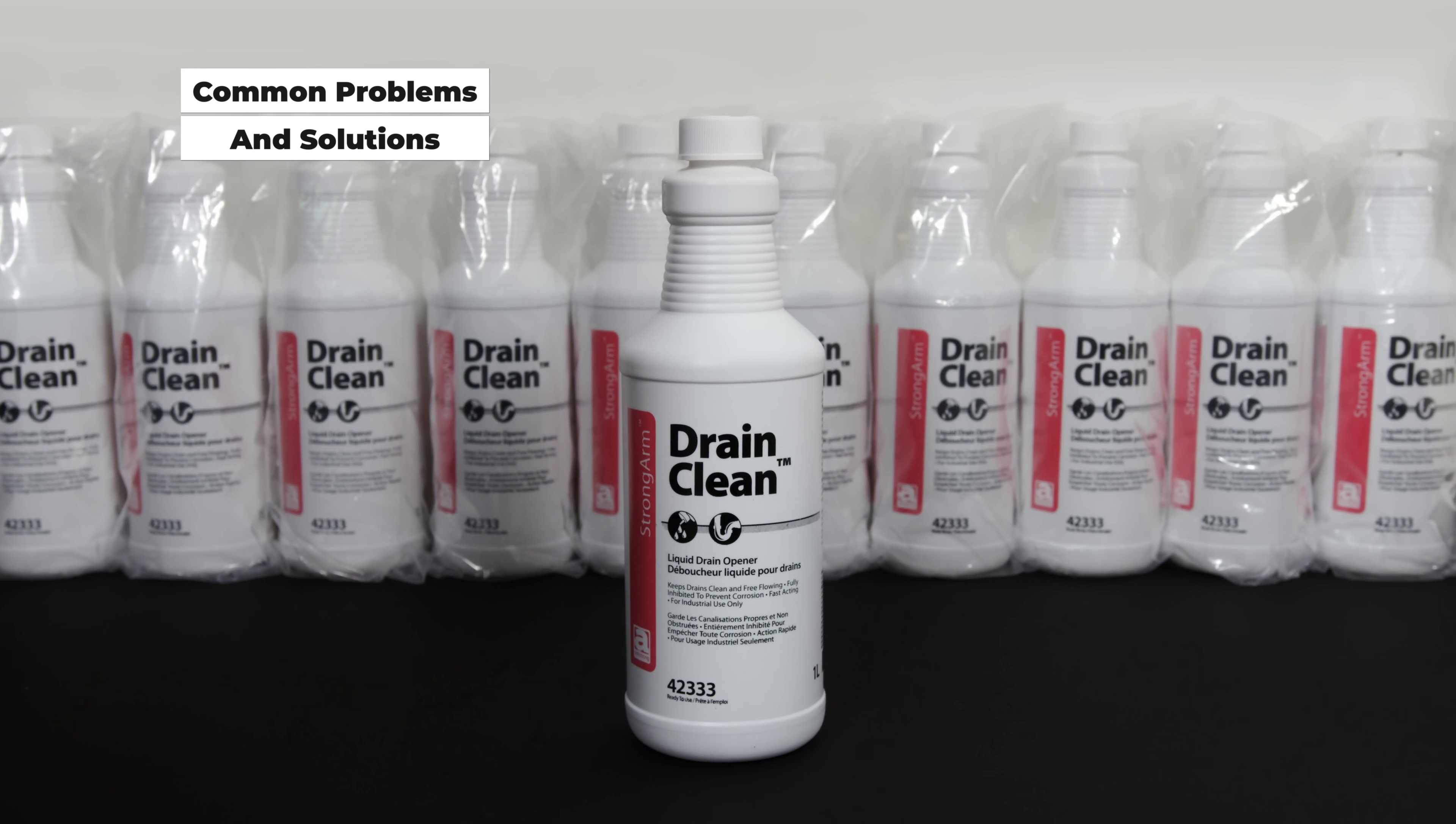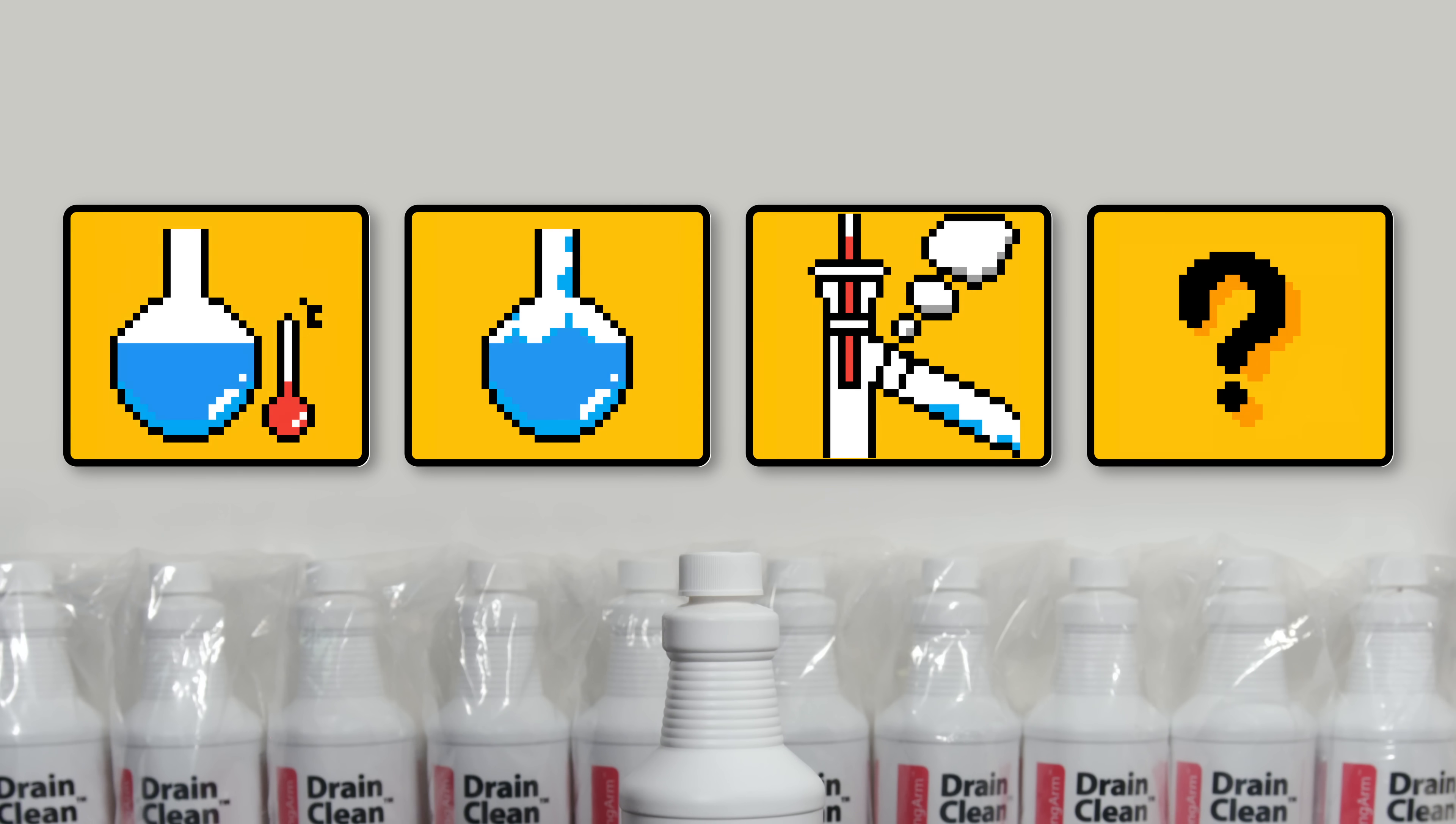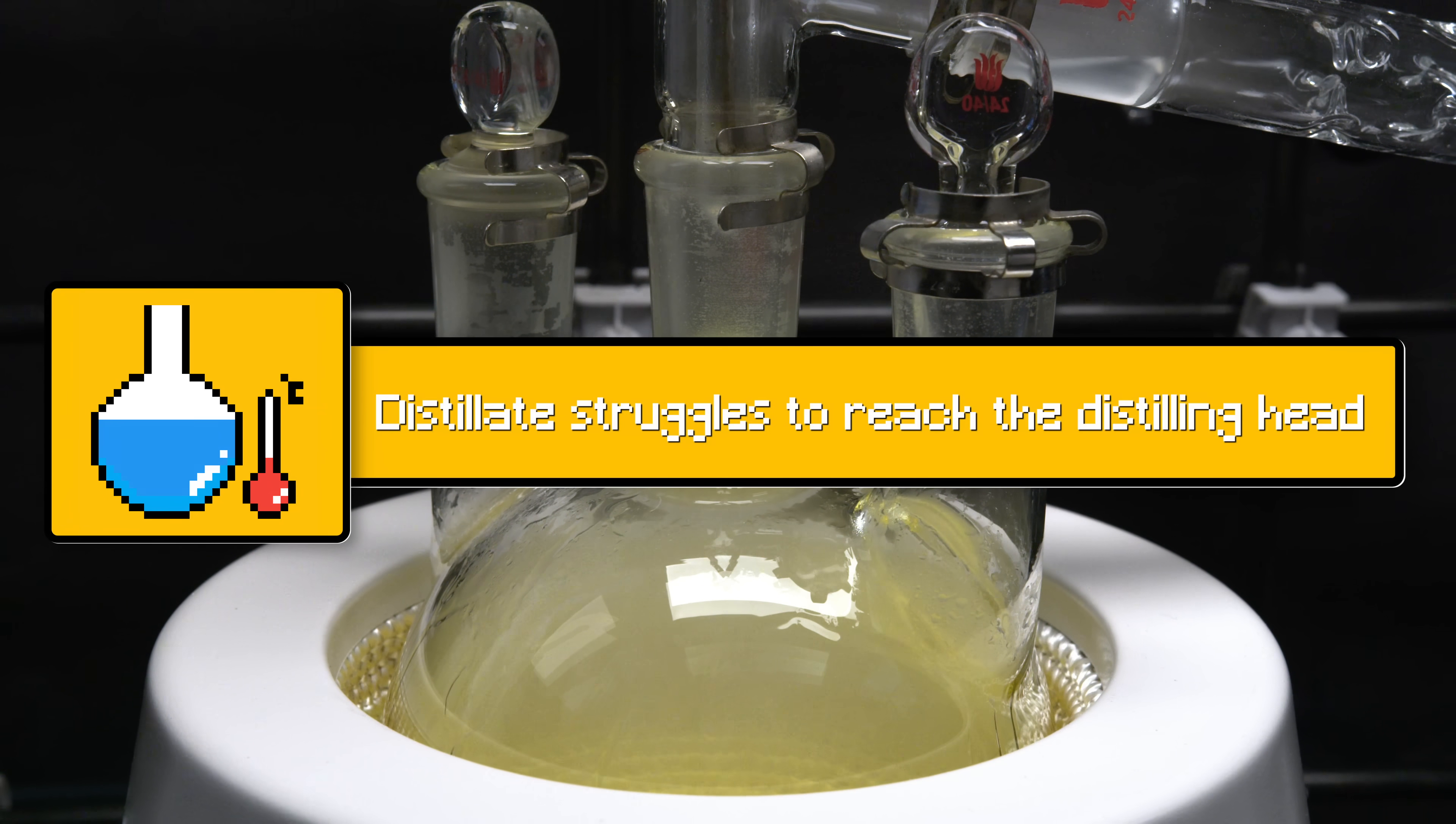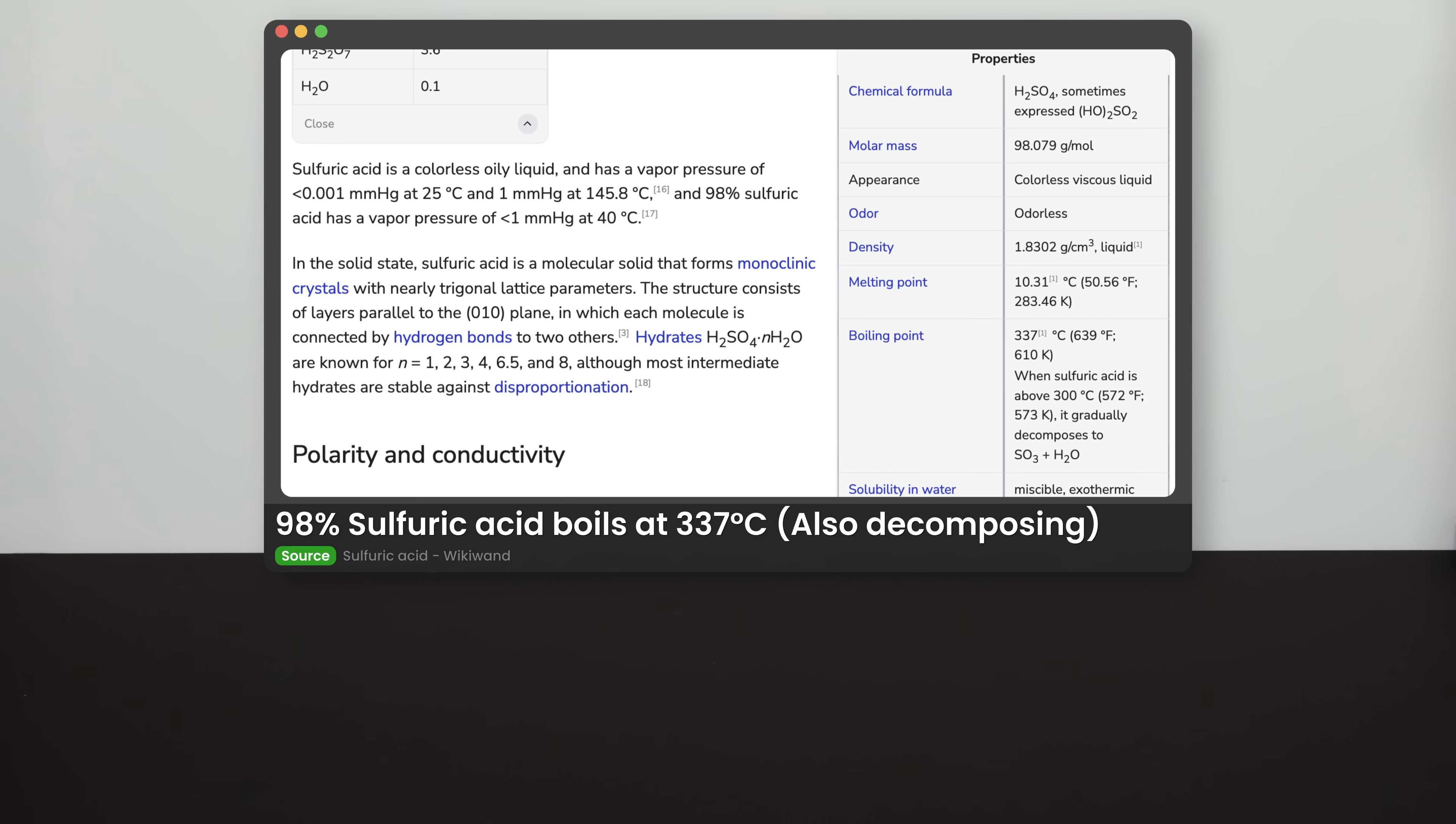As I mentioned at the start of this video, there are 4 common problems associated with the distillation of concentrated sulfuric acid. I will present you with the problems, then with the solution in the order of importance. The first problem you might encounter is that the distillate struggles to reach the distilling head. This is the major problem for this distillation, since you can't distill anything if you can't reach the boiling temperature of sulfuric acid. The component that requires attention for this problem primarily is the heat source. 98% sulfuric acid boils at 337 degrees Celsius, and in reality it requires a temperature much higher than this to sustain constant boiling.